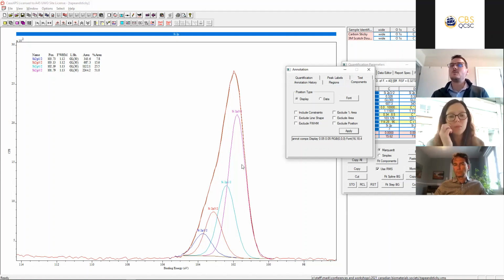Sometimes you see papers out there and they've just thrown a whole bunch of peaks in of various peak widths. One peak will be really skinny, one peak will be really wide, with no real reason why, other than the math thought it was a great way to do that. All the math does in the software is try to get the best fitting of this whole envelope, but that best fitting may not make chemical sense. So we have to make sure that what we're doing makes chemical sense as well, right? Right. Yeah. Thank you.